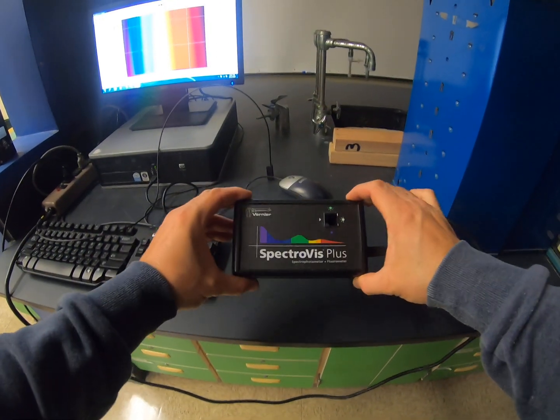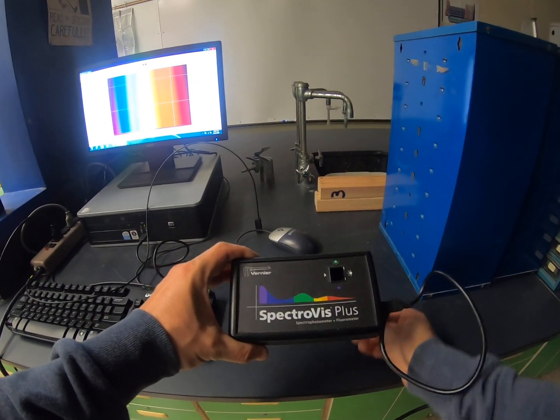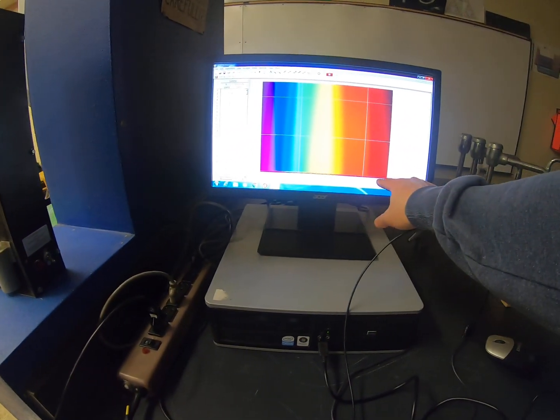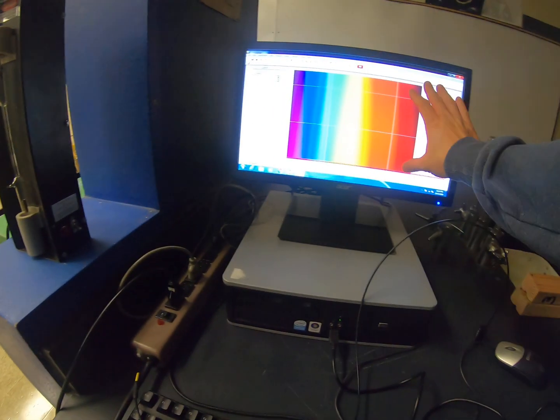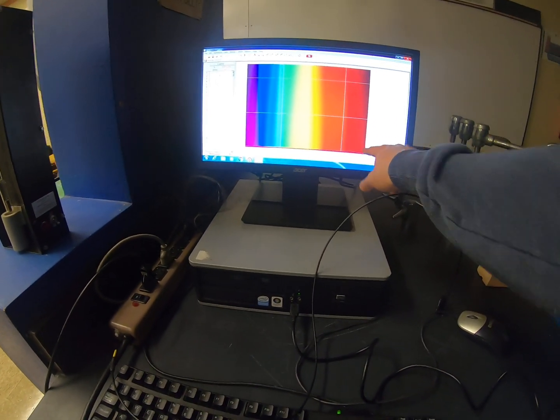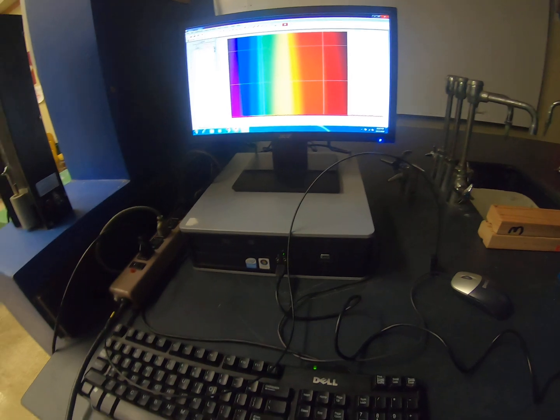All right, so this is a spectrophotometer. It looks like a little black box. That's all it really is. It has a little light sensor in here, and it's connected to my computer where I can basically see what wavelengths are being detected by the detector. They've color-coded it for us, but this is 400 nanometers up to about 750, maybe 800 nanometers. So it goes from violet to red, right? Roy G. Biv. And you can see how intense things are.